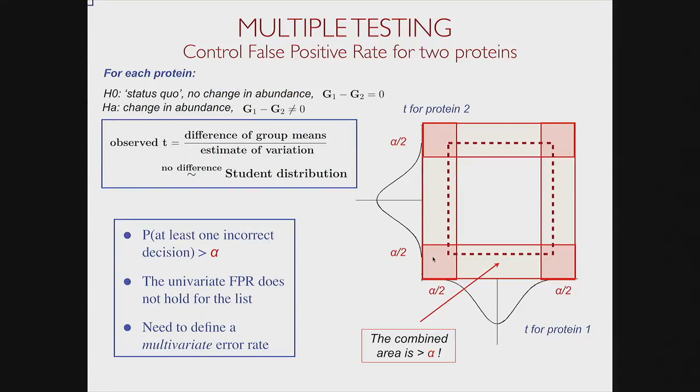So there was a really big contribution 10 plus years ago in the statistical literature, where people said, well, you know what, here we are controlling the probability of making at least one mistake.